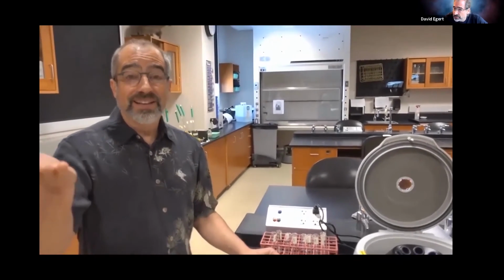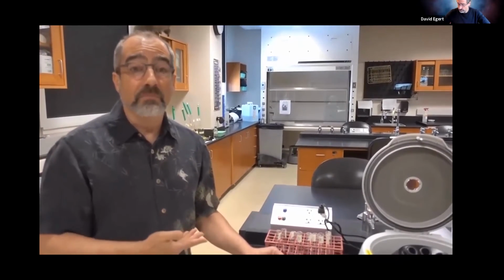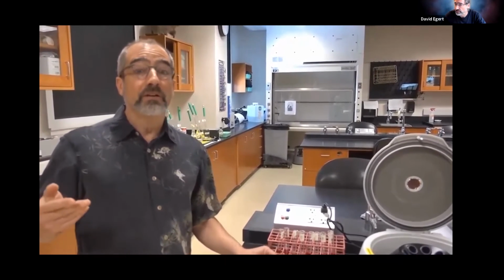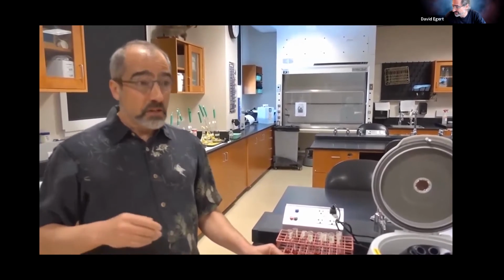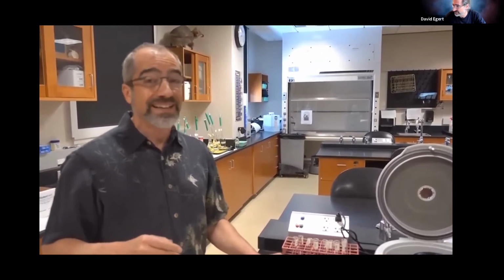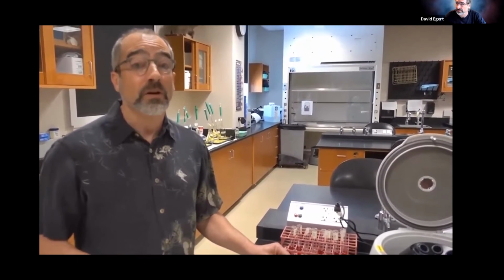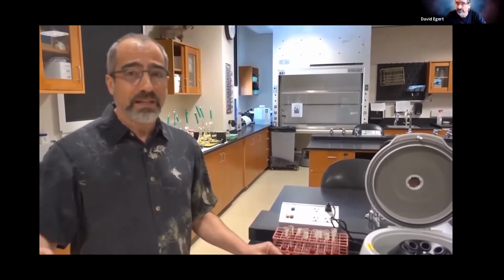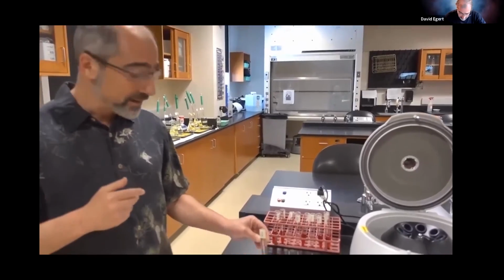And in fact, a little clue, when we look at this under the microscope and you're trying to see what happened, imagine you were in a room full of balloons and then every balloon got popped. And then you walk in the room and, let me see what it looks like in this room full of popped balloons. It's not going to look like much of anything. Maybe you're going to see some shreds of rubber on the floor. So people get kind of frustrated when they're trying to figure out what am I supposed to see here? Think about that.